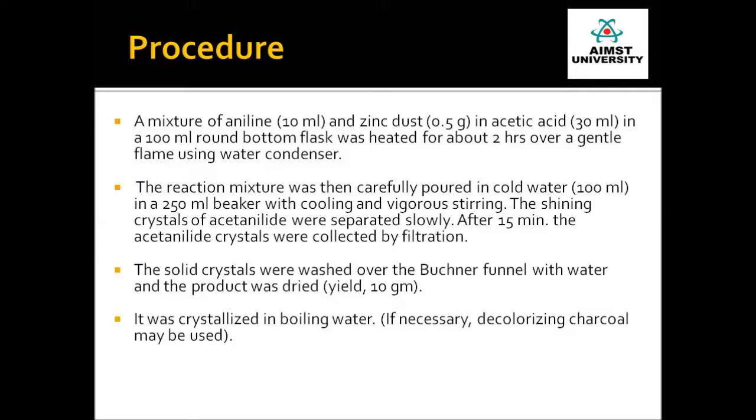Now let us see the procedure in detail. A mixture of aniline and zinc dust in acetic acid in a 100 ml RBF, that is round bottom flask, was heated over a gentle flame using a water condenser. Heating was continued for about 2 hours. The reaction mixture was then carefully poured into cold water in a 250 ml beaker with cooling and vigorous stirring. The shining crystals of acetanilide separated slowly. After 15 minutes, the acetanilide crystals were collected by filtration.